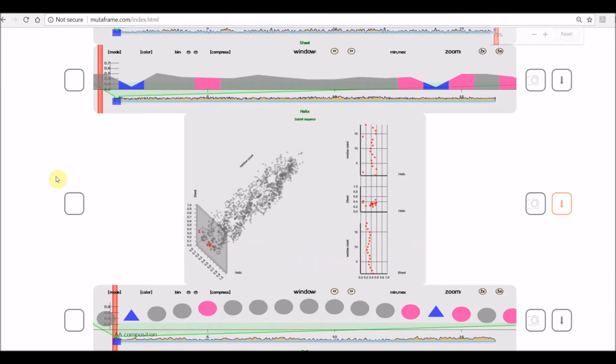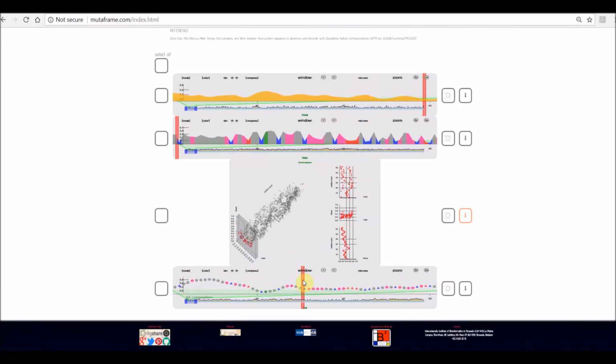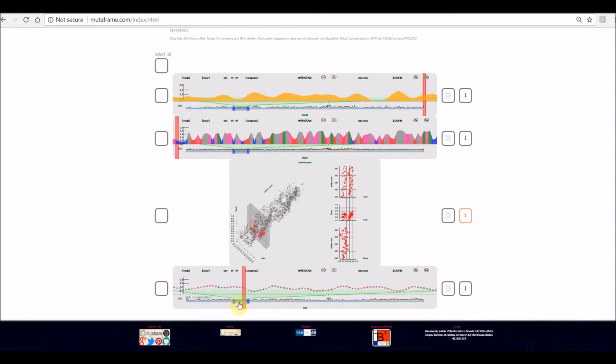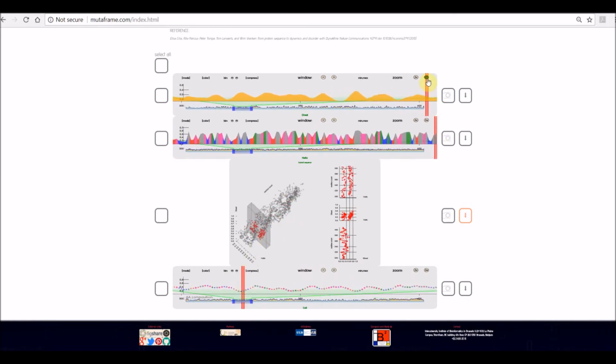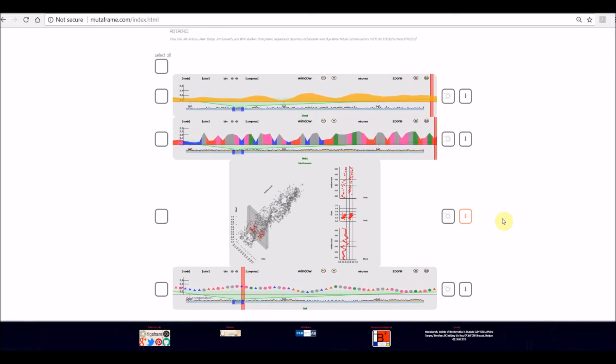But since the box is synchronized with the other two, I'm going to zoom out a little bit to show you. The rest also is controlled by this module. So now I move the one below, everything moves. If I move the box, everything moves as well. If I zoom out in this one, the bottom one will respond as well. We can do something more interesting.